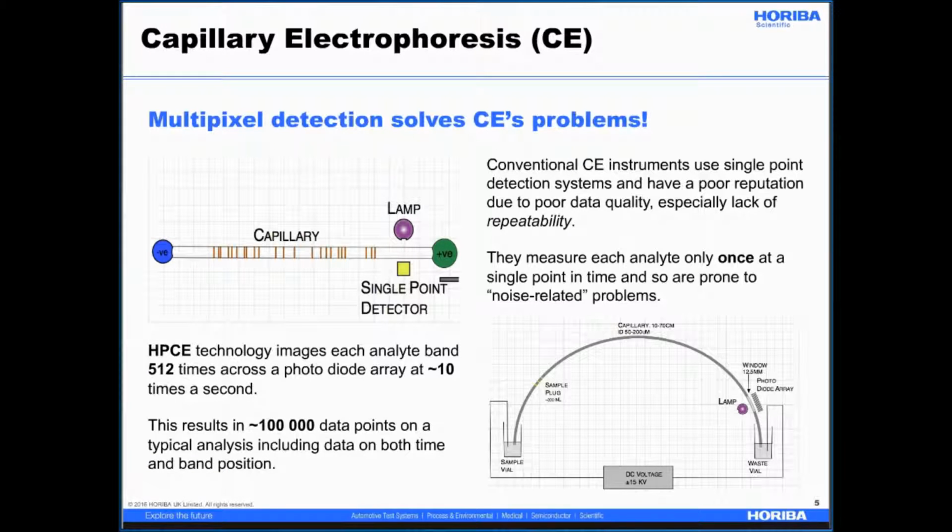The instrument performs a self-check prior to each sample being run. This makes sure that the capillary is functioning well, that it isn't cracked or broken, and that it is adequately filled with buffer. We are also able to identify and discriminate against any species moving in the opposite direction to the direction of electrophoresis, or with an unexpected velocity.